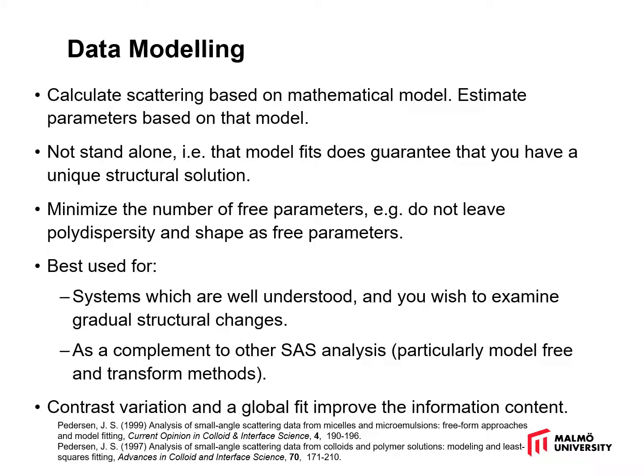In the remainder of this talk, I'm going to focus on data modeling. So in this approach, one calculates the scattering based on a mathematical model and uses the parameters in that model, and compares what you can calculate to the actual measured scattering to get an estimate of the structure.